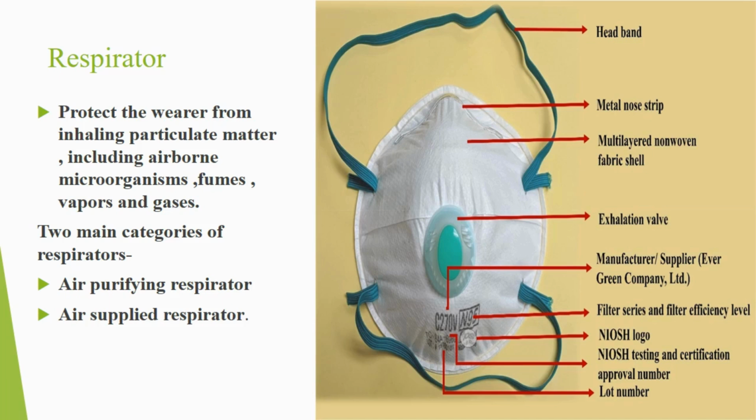First, you have to check whether it is sealed. The respirator is compressed to ensure a seal across the face, cheeks, and the nasal bridge. A positive pressure seal can be checked by gentle exhaling, and a negative pressure seal of the respirator is checked by gently inhaling.